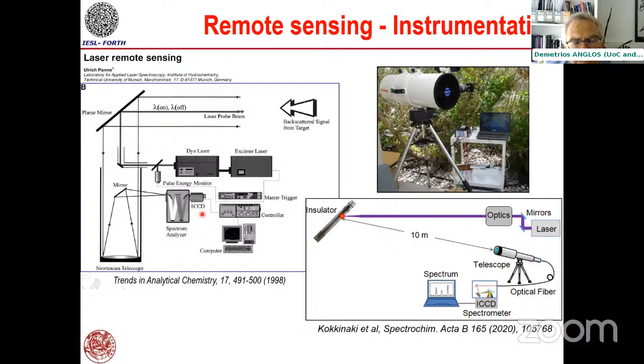Therefore, we can record spectra, or we can record intensities at particular wavelengths, or we can do both. And this way, we can analyze various pollutants in the atmosphere, identify them, measure them, and so on. A variant of this, which does not really contain lasers, is the satellite imaging instruments. There are plenty of those nowadays, and they do environmental work. So they are tuned to particular molecular transitions, and measure greenhouse gases and others.